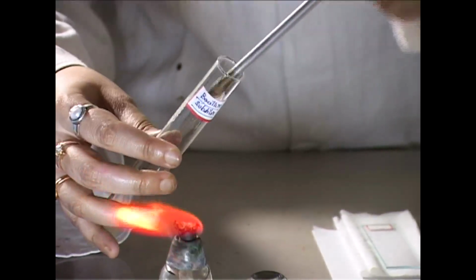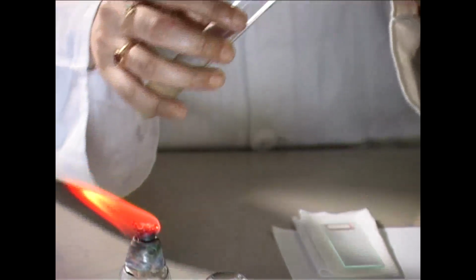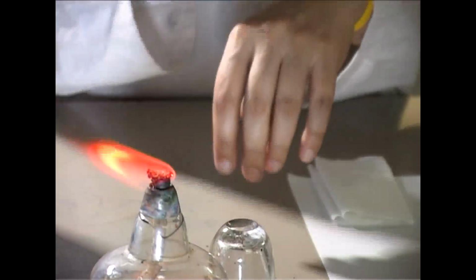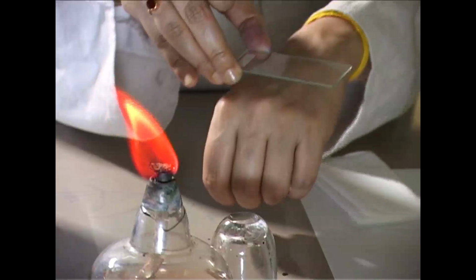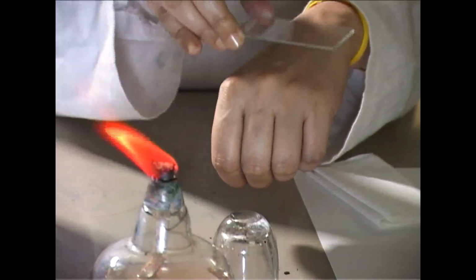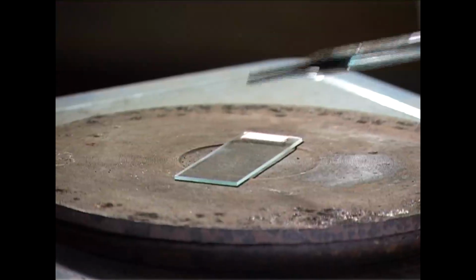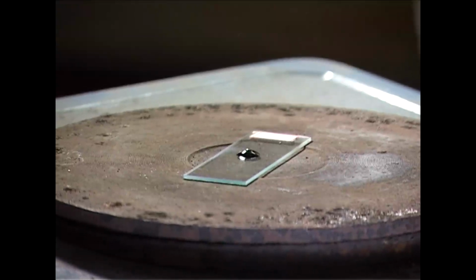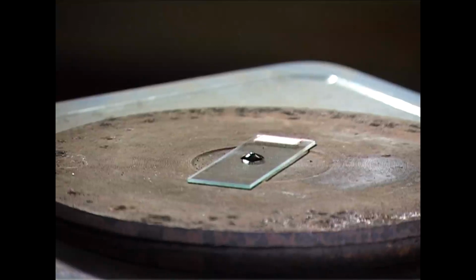Now, what is the procedure? First, we prepare a smear of culture on a clean grease-free slide. We air dry the smear and then heat fix it. After the heat fixation is done, we stain it with malachite green and keep it on a hot plate, because heating helps in the penetration of the primary stain.